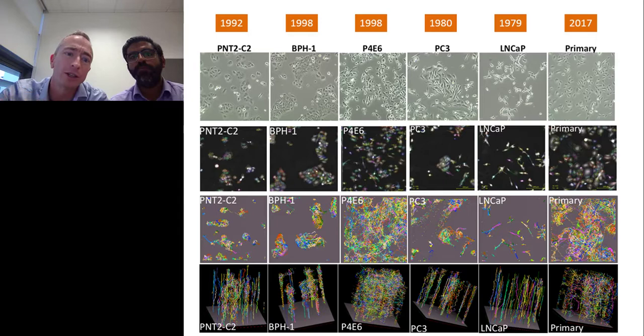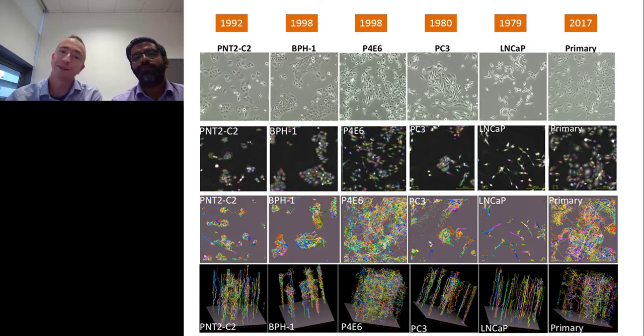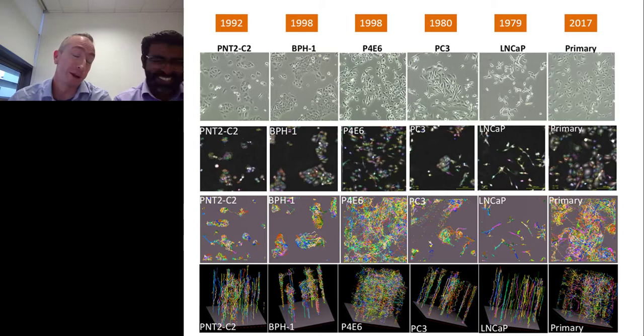And that just shows you how critical it is. Even just using cell lines can have an effect, but using primary cells is great. But if we were then to go and label those primary cells, there's a good chance we'll perturb them further. We've already extracted them, so we're not perfect, but at least we can minimize those perturbations, and that shows just what difference that can make.